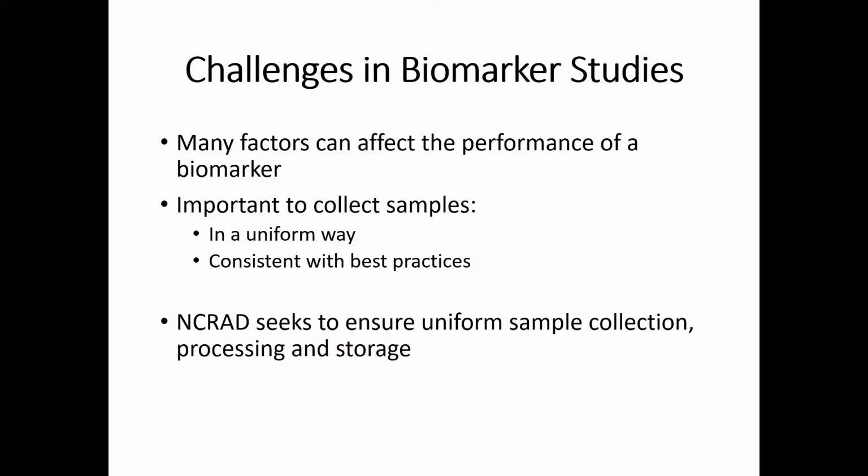There can be challenges in biomarker studies, which makes using a repository like NCRAD valuable. Many factors can affect the performance of a biomarker, and so it's important to collect samples in a uniform way and consistent with best practices. So NCRAD seeks to ensure uniform sample collection, processing, and storage.